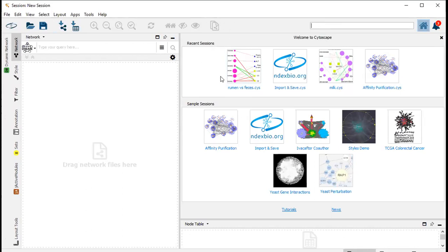But for this purpose, our NGS data, I will show here.